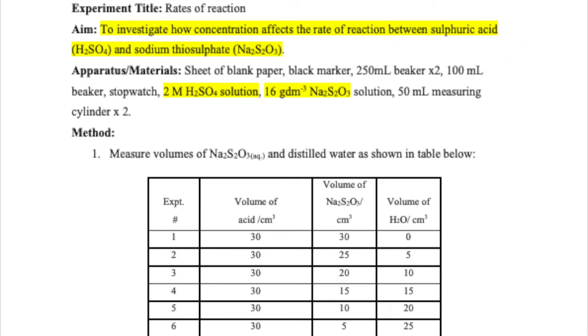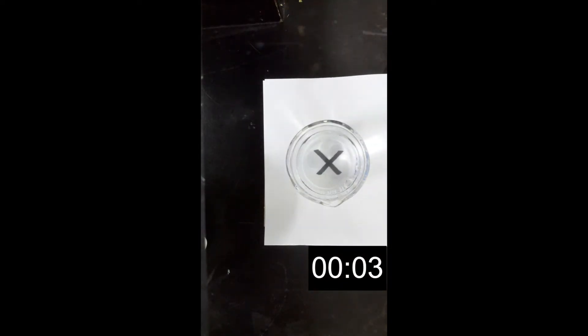We will be reacting sodium thiosulfate with 2 moles per dm³ sulfuric acid. We're going to keep the volume and the concentration of our sulfuric acid constant. But we will manipulate the volume and hence the concentration of our sodium thiosulfate. We will start with 30 ml of sodium thiosulfate — that's 0.1 mole per dm³ — pour that into a 100 ml beaker and put that beaker on top of a piece of paper on which we mark an X. We will then carefully pour 30 ml of our sulfuric acid into this and immediately start our stopwatch.